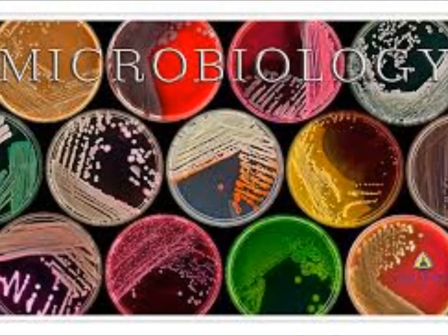You can only put one organism on one side, and the other side is for the blood. For the gram stain, you're going to put your drop of water first. Add your drop of water to your slide first. Then you emulsify the colony into the water. So you want to break the colony up pretty well in the water. You want it to emulsify.